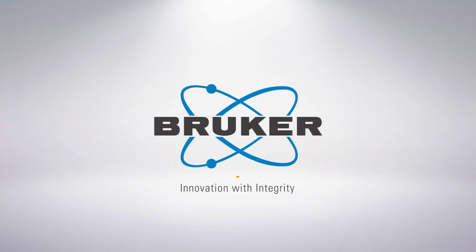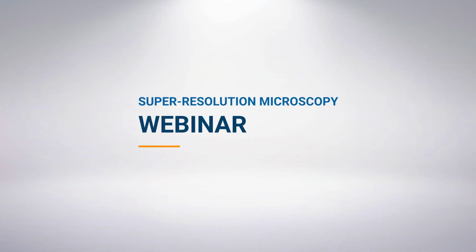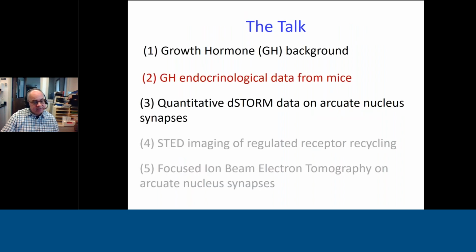I have to explain to you how we actually get these hormone cycle data from the animals. In particular, what we're doing nowadays from mice; these older data, if I go back to 1 year, these are, of course, also cycled animals, but there we were doing that with rats. And in a rat, you may imagine it's a relatively big animal. There's no problem over a period of 3 hours or so to withdraw about a milliliter of blood every 20 minutes, spin down the hematocrit, resuspend it, and re-inject it, where you keep the plasma for later analysis of hormone content. If you did that to a mouse, you'd kill the mouse.